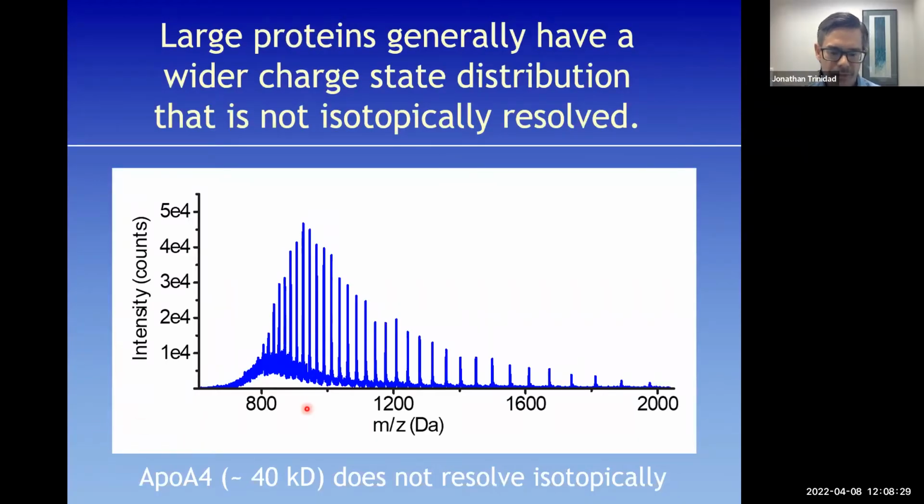I'm assuming you all have a basic familiarity with mass spectrometry. I didn't want to go into too much intro background here for purposes of time, but here is a protein that's coming off of an LC column. So it's being sprayed in acetonitrile water with some formic acid. It's going to be, quote, fully denatured, and all of the lysines and arginines are going to potentially pick up charge. And so for one given compound, this is a single protein, we see a range of charge states.